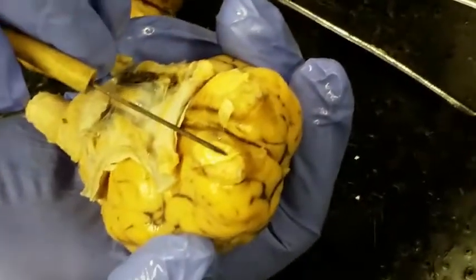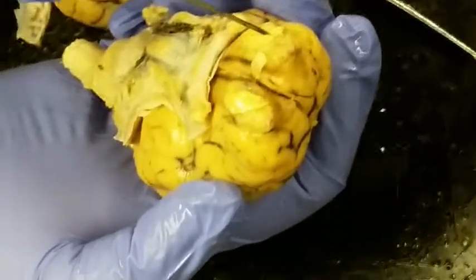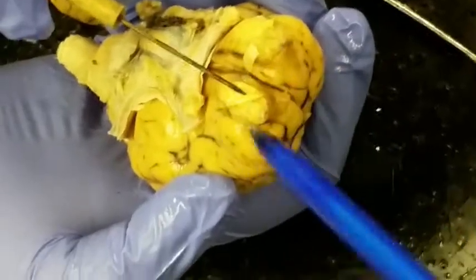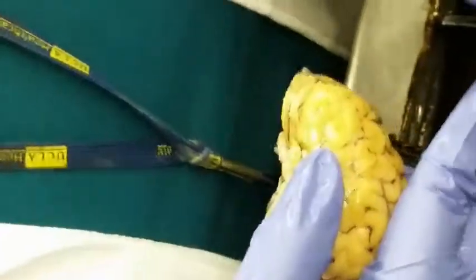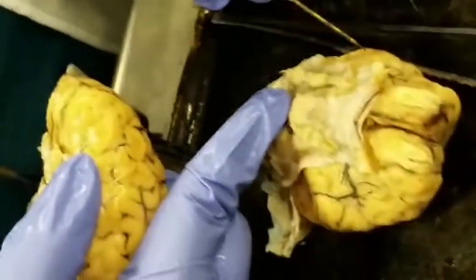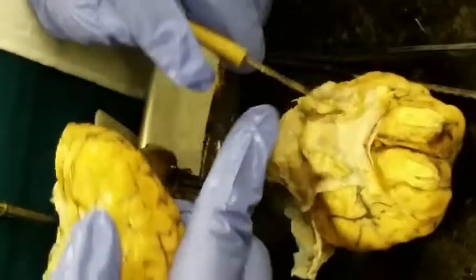Now, what is this? Same location. What is it? The olfactory bulbs. Bulbs, yeah. See, it's nice and big. The olfactory bulb. There it is also, the olfactory bulb. Again, this is the optic nerve. Here's the optic nerve. In the middle is the optic chiasma.